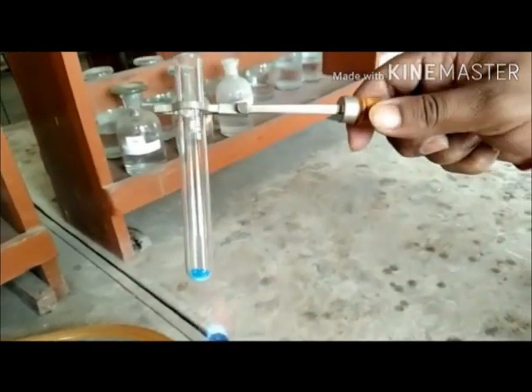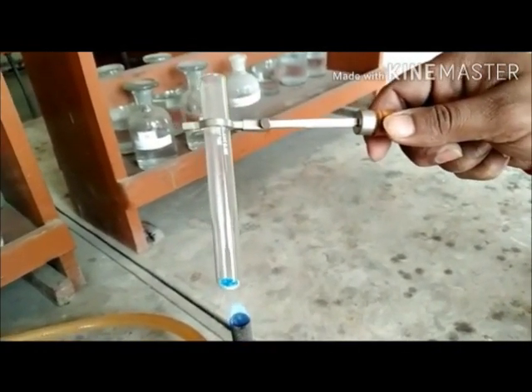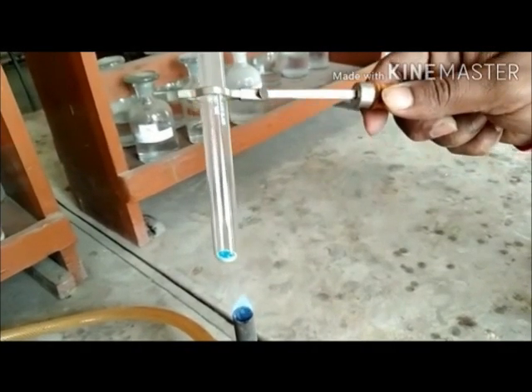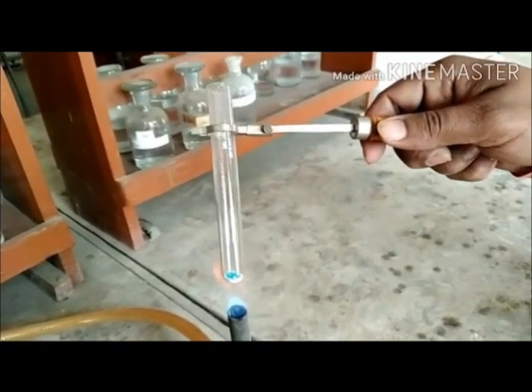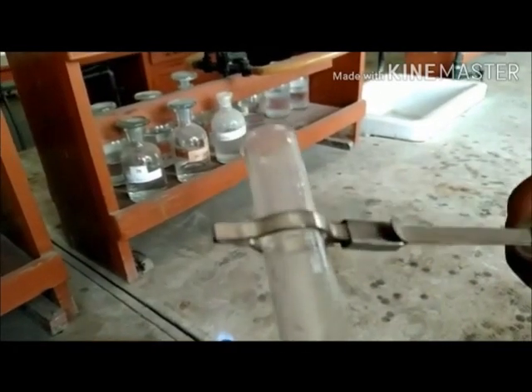Now we observe that as the salt is heated, its color starts changing from blue to white. Also, you can observe on the surface of the test tube that certain water droplets are getting condensed, showing that the water of crystallization that was present in copper sulfate crystals is getting removed and then getting condensed on the walls of the test tube. Finally, we obtain a white colored anhydrous copper sulfate salt in the test tube.